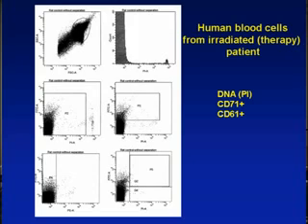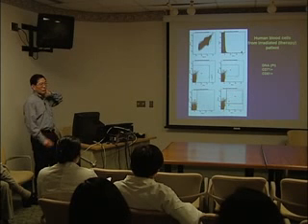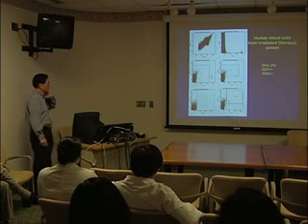In general, it's less than what we got from mouse. But we couldn't say the absolute production is less than mouse, because the dosimetry is very difficult to calculate in this case, because the patient didn't receive total body radiation. This is local radiation. But on the other hand, we were able to isolate these cells for other studies.